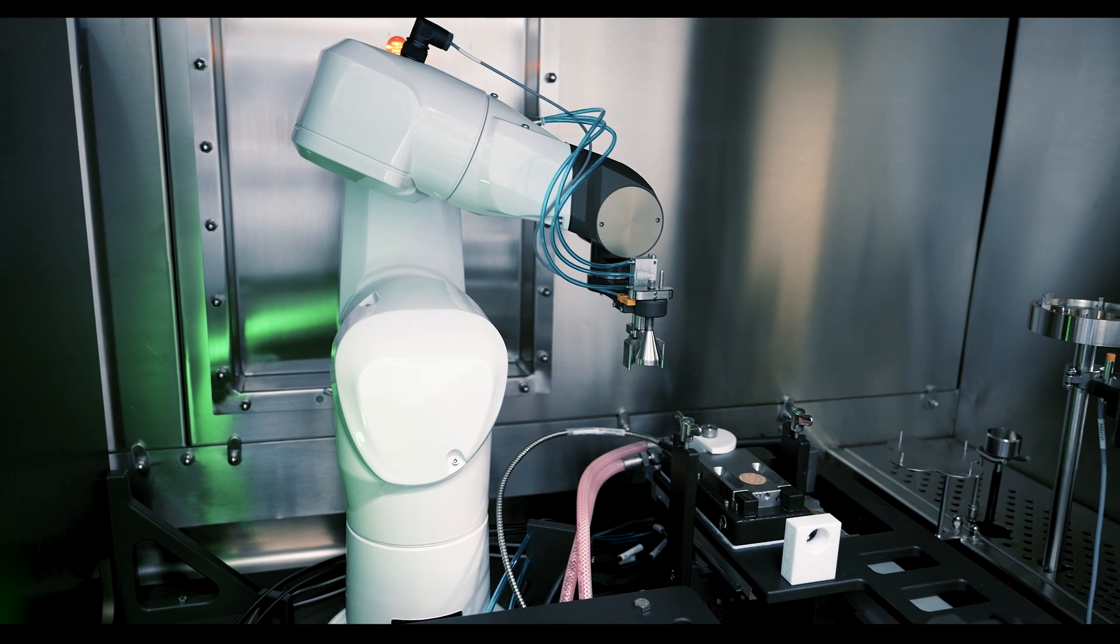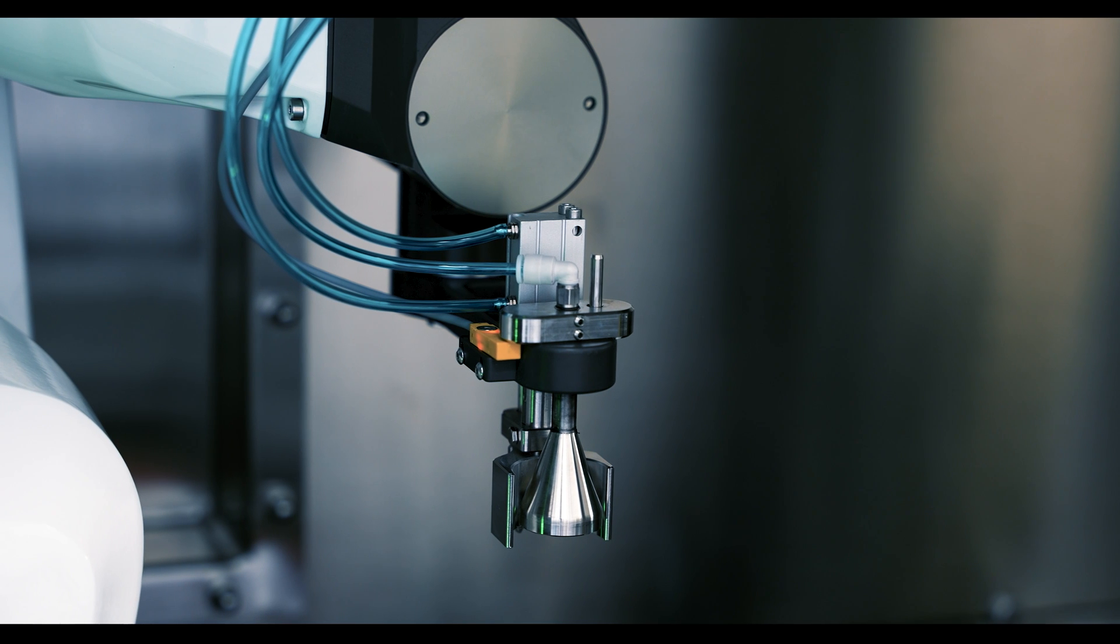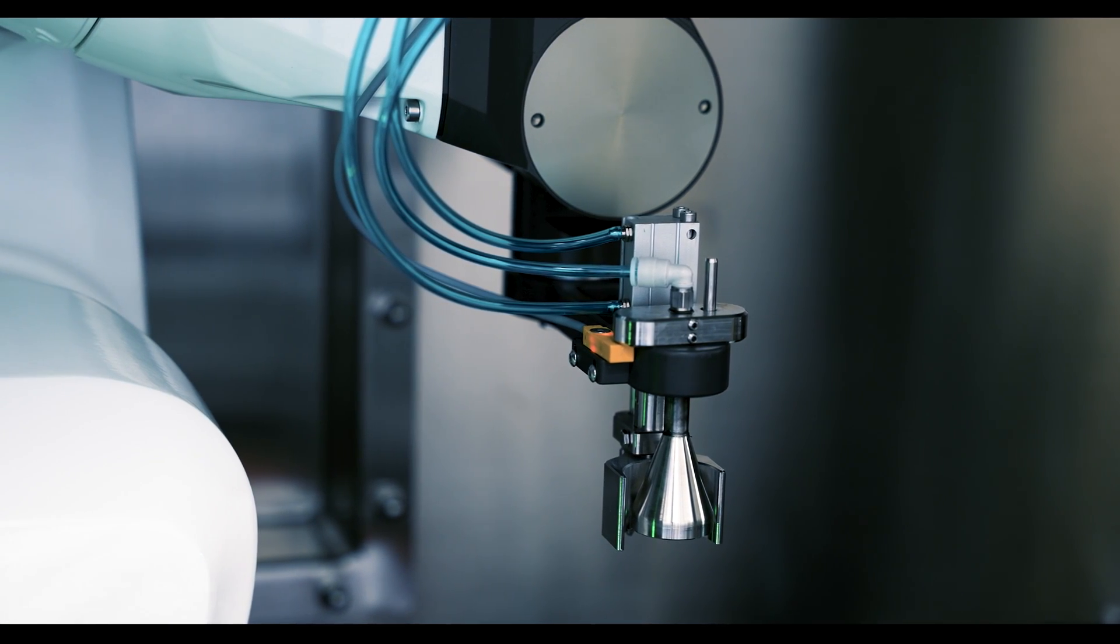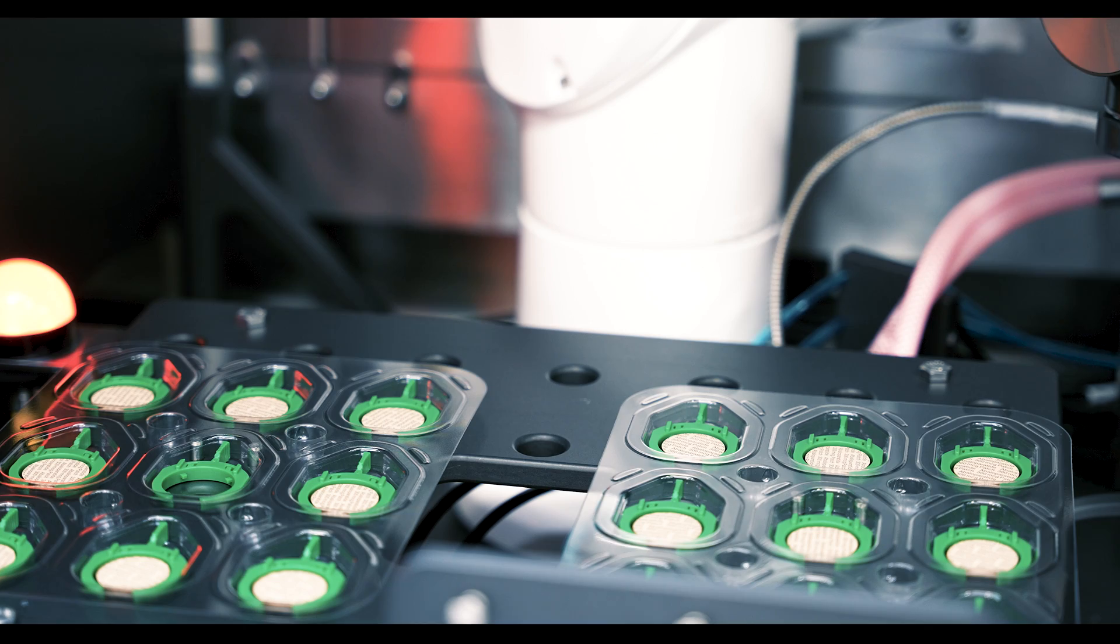The robot itself was really about trying to acquire this part with the end of arm tool and presenting it precisely into the drug system that was dispensing and actually coating.